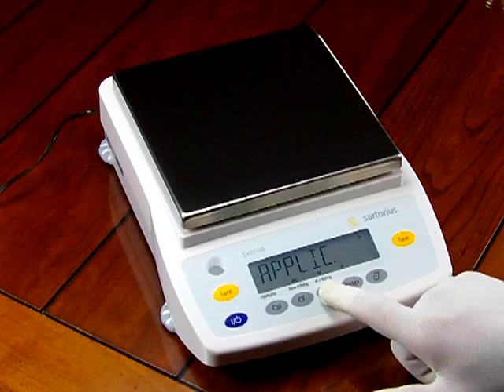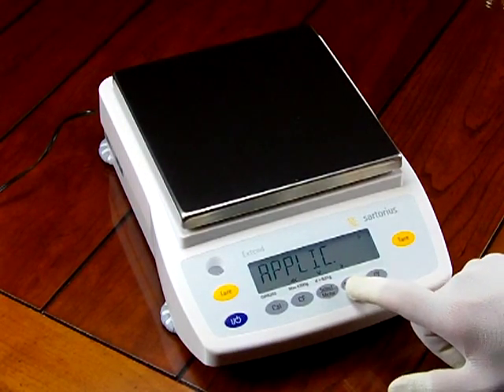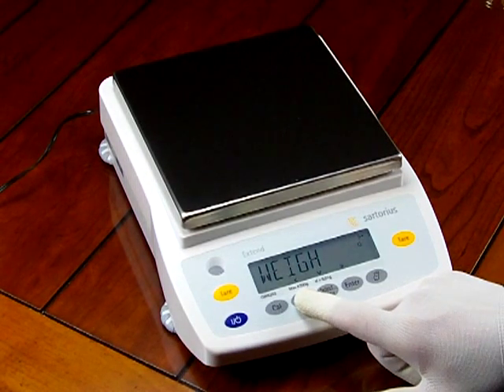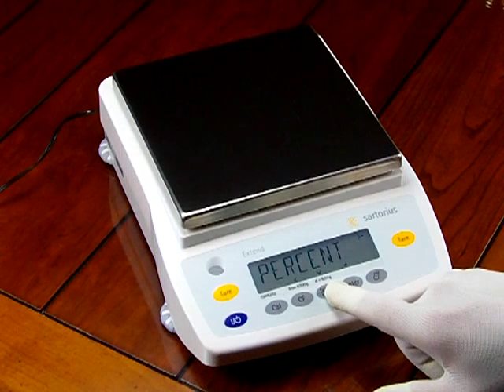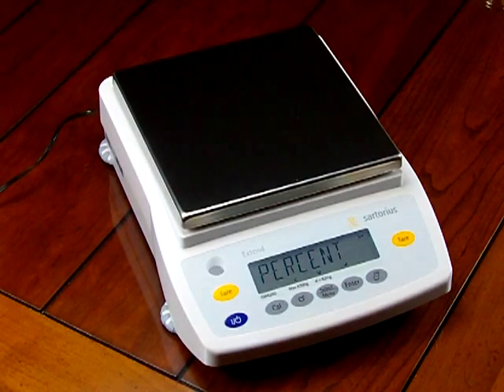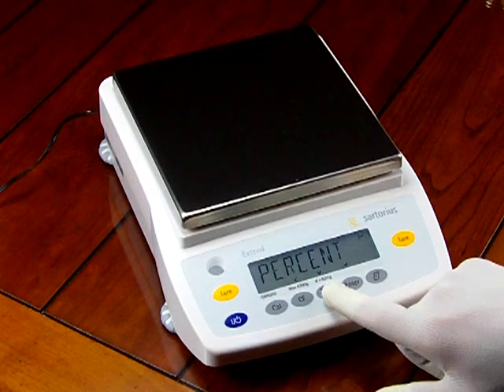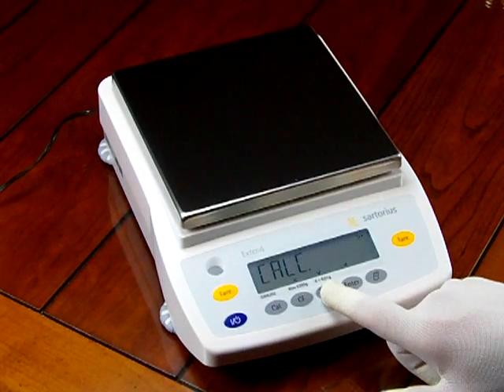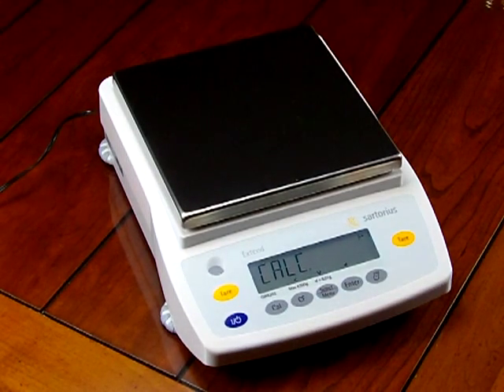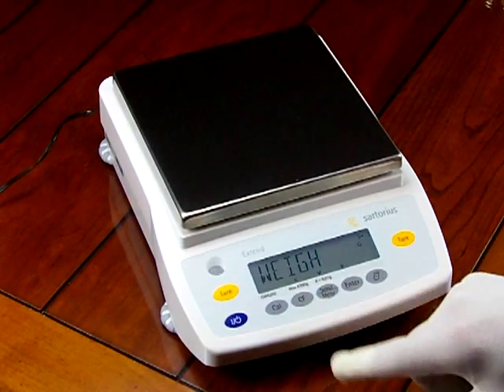Press and hold Select to enter the menu. You can scroll through whether you want to set the application — we're in weigh mode — or change to different units. You have parts count, percent weigh mode (used to obtain a weight readout proportional to a reference weight, useful for mixing formulas like ink), net totalization, animal weigh mode, a custom weigh unit feature, and density mode.